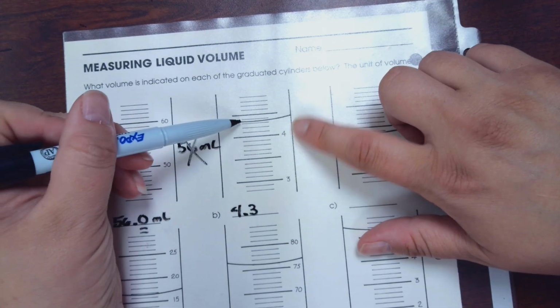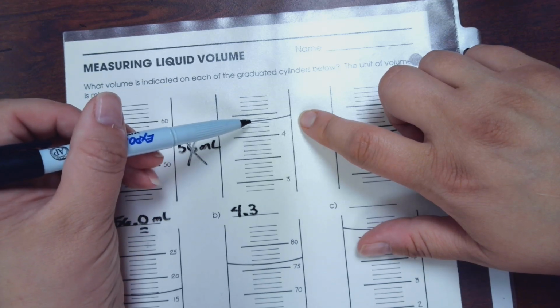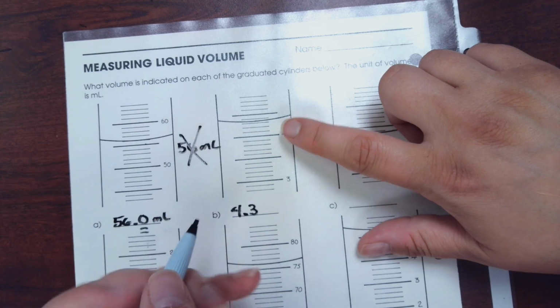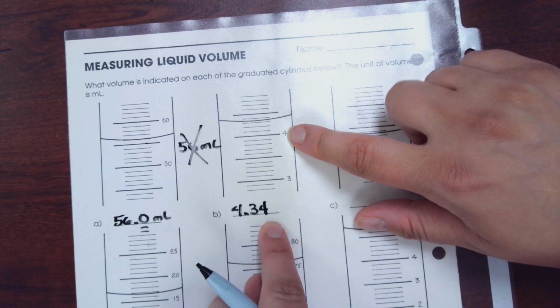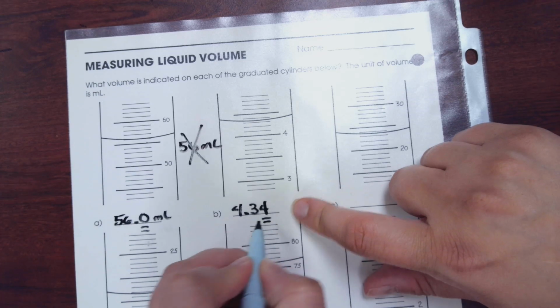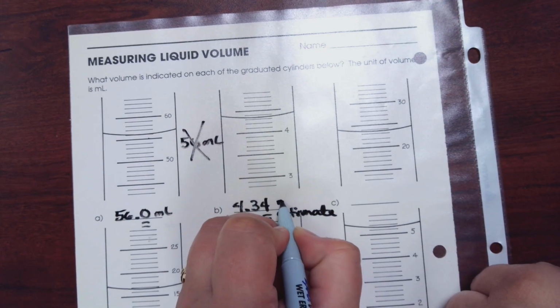and now I'm going to estimate. Now, it's almost halfway. It's almost right in the middle, but I think it's a little lower than halfway. So I'm going to scale of 1 to 10 this. Halfway would be 5. Since I think it's a little lower than halfway between the two lines, I'm going to call this 4.34. Now, someone else might call it 4.35. Someone else might call it 4.33. All of those would be acceptable. This final digit is an estimate. Okay? It's an estimated digit.